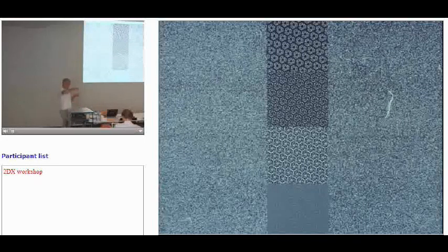Obviously, if it's a big one, and it sticks out like P-type ATPase does, you have a bigger signal. You will be able to see the molecules in the raw image of the crystal. So what we've done here is we multiply it by 10 to bring it onto the same scale, but you can see it's not recognizable. This is the CTF correction of the image, and so now you can see the molecules, and then we add in the proper electron diffraction intensities, which don't have zeros in the CTF, and do threefold averaging, and that then is a more or less perfect noise-free projection structure of the molecule.